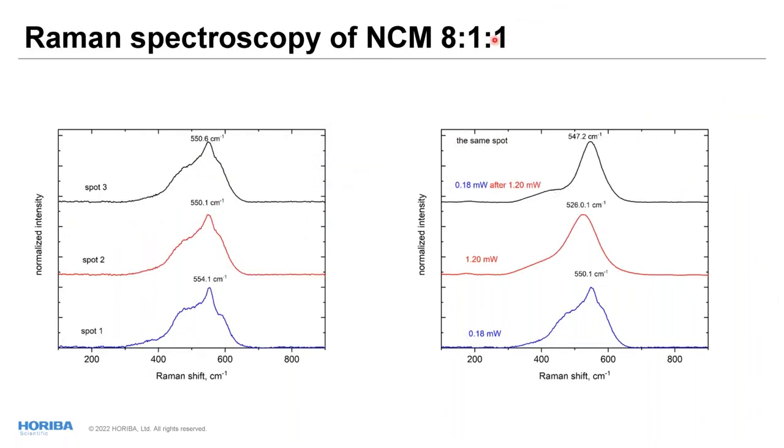This is NCM 811 materials. You have to use a power less than 0.5, 0.2 milliwatts to get the real good spectrum. You see here the spectra look very similar in three points. And again, strong influence of laser power. As you can see, in low power, we have a very good band. Once we increase the power to 1.2, almost 10 times, we're getting a broad band. And it's broad band when starting to do the same point is not returning to the original position. It's still broad and still getting really broad.